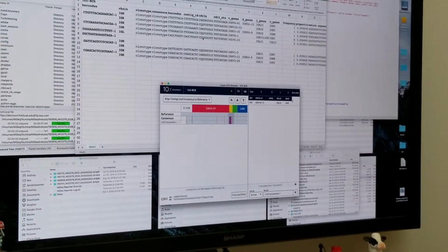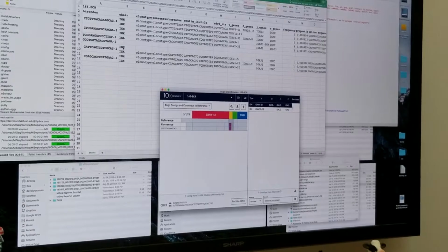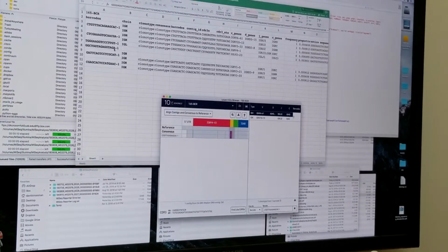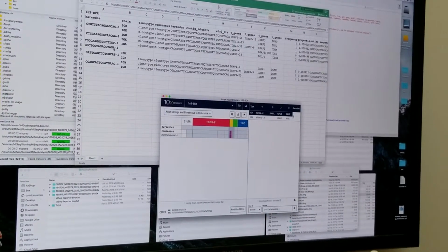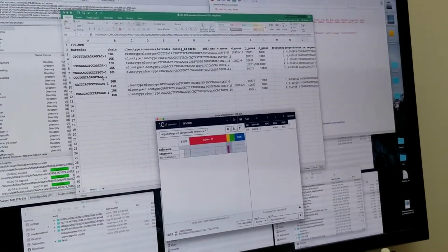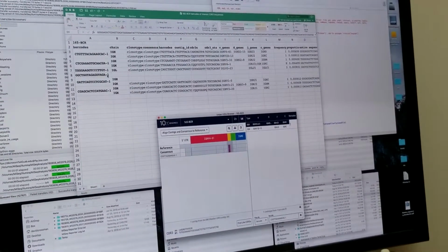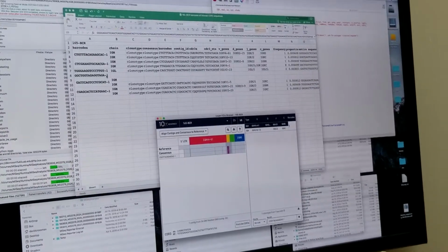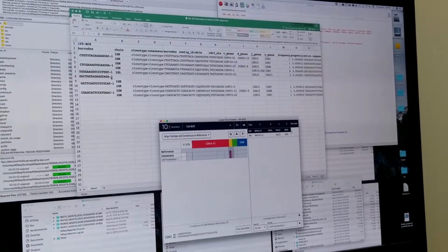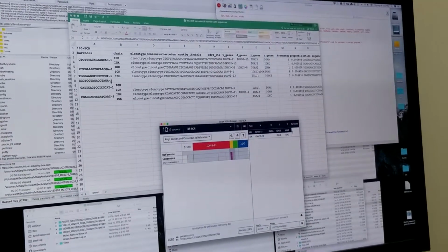It's possible. That's interesting because we wouldn't pick that one. Of course, and some of them only had, I had both. This one only had the kappa and didn't have the heavy. That's interesting. And I still can't find this one in any of the data. I can't find that barcode at all, even in the rawest of the data. I double checked that I didn't type it in wrong, because you had a picture image of all those, and I just typed it out. It'd be interesting to see what it is. We have to go back, because we got that at a crude level.